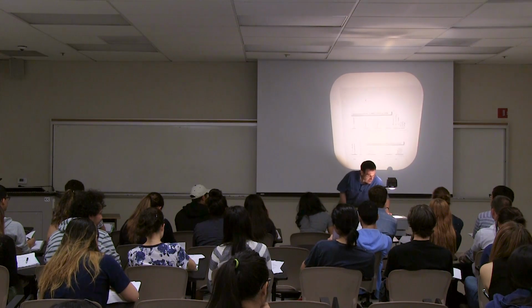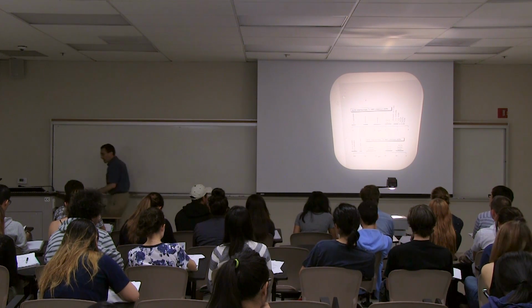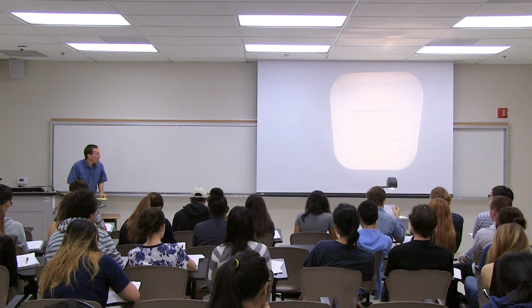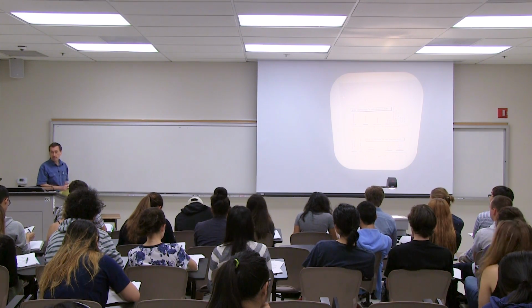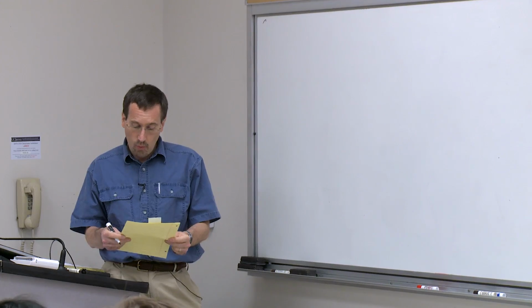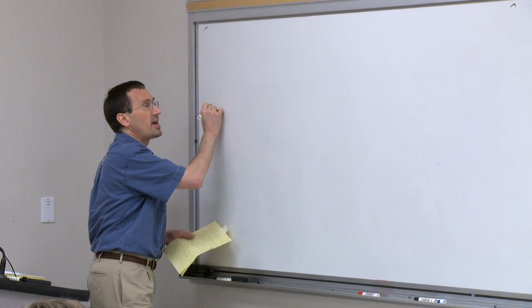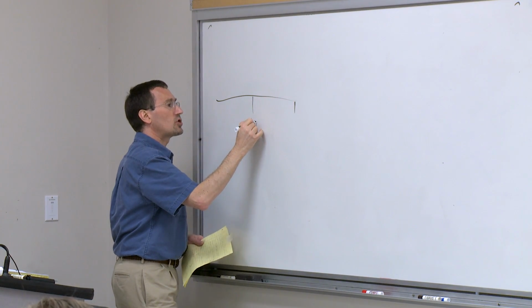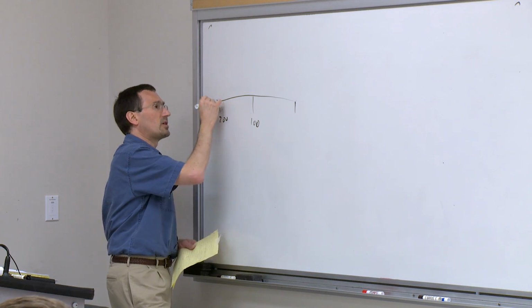All right, so that's one of the things that I like to do, and I urge you to do, is read. Now, there are lots of useful things you can get from C13 NMR. One quick thing is simply, well, let me give you an example of a spectrum. I should show you what a spectrum sort of looks like.